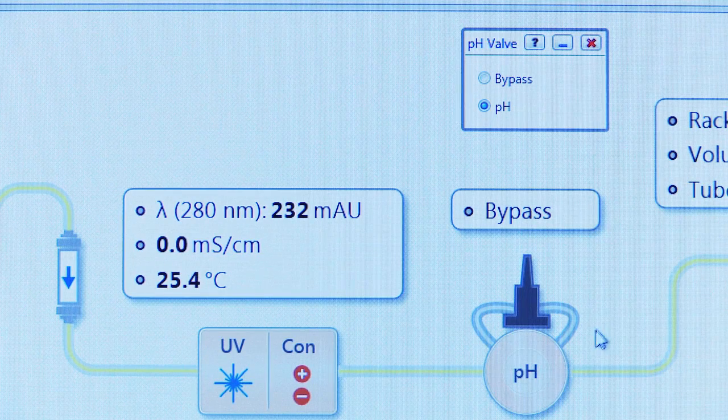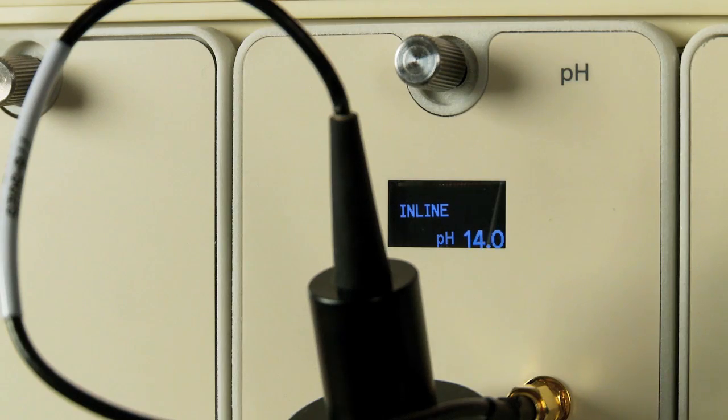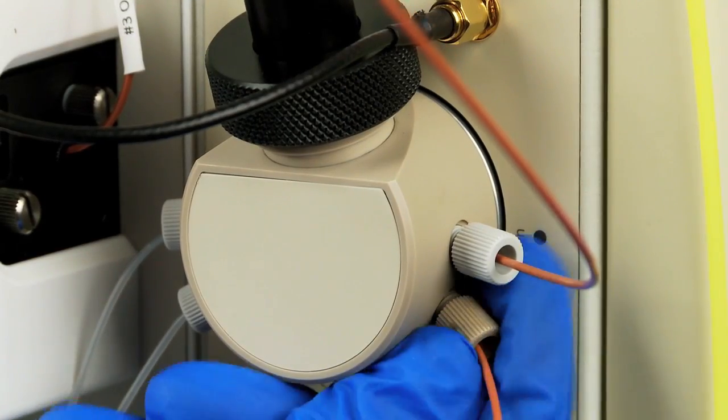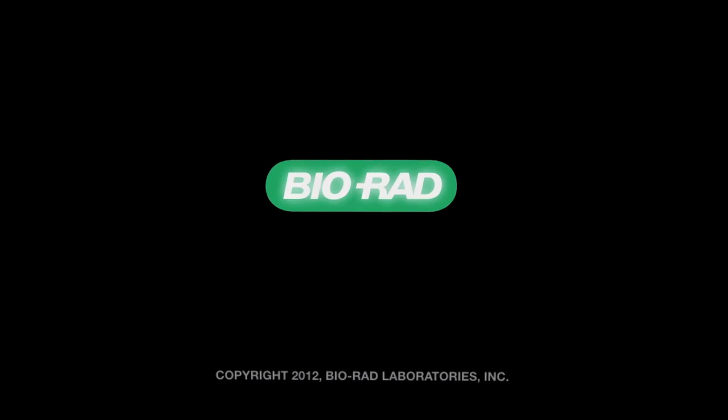Switch back to pH position to ensure the valve is in line with your flow path. Finally, make all the plumbing connections necessary for the configuration of your instrument.